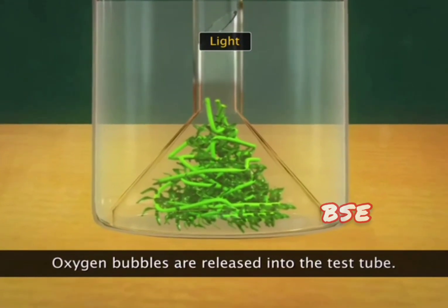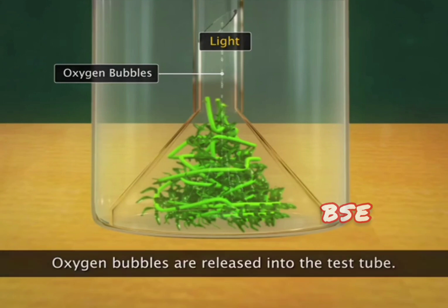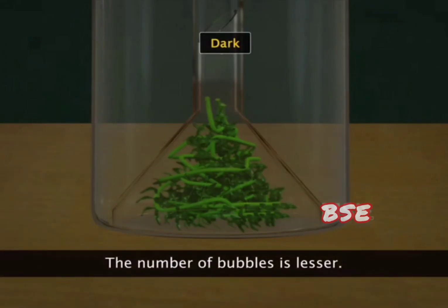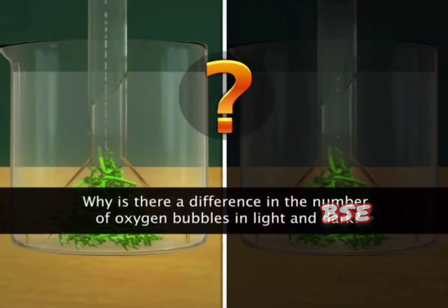When the setup is kept in light, we observe that many bubbles evolve continuously into the inverted test tube. These bubbles are actually oxygen that is released during photosynthesis in hydrilla. When the setup is kept in dark, the number of bubbles will be comparatively less. Why is this so? Why is there a difference in the number of oxygen bubbles when the plant is kept under different conditions of light?